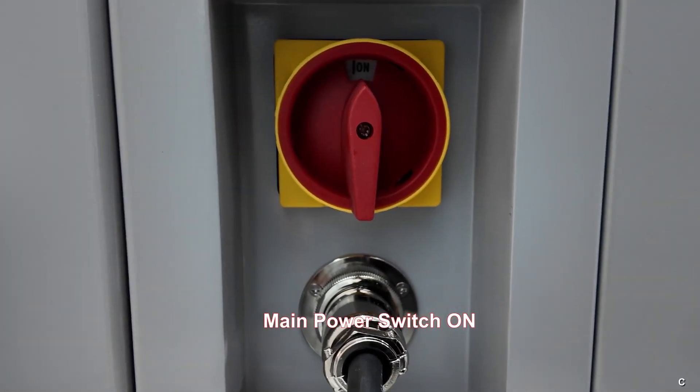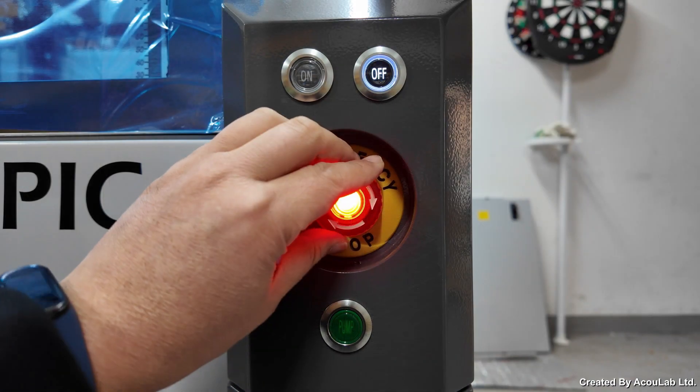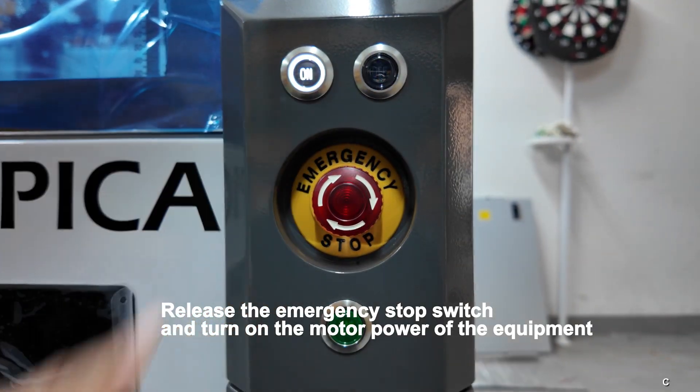Turn on the main power. Turn on the computer. Release the emergency stop switch and turn on the motor power of the equipment.